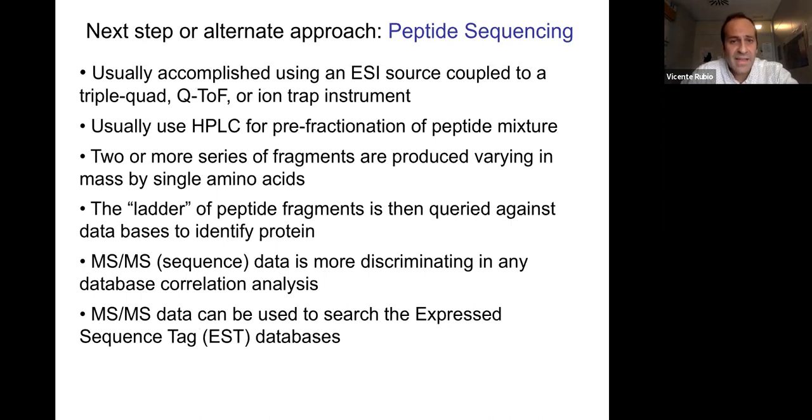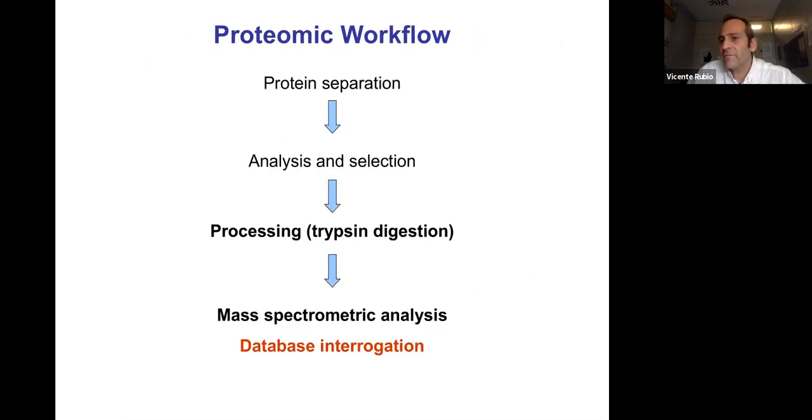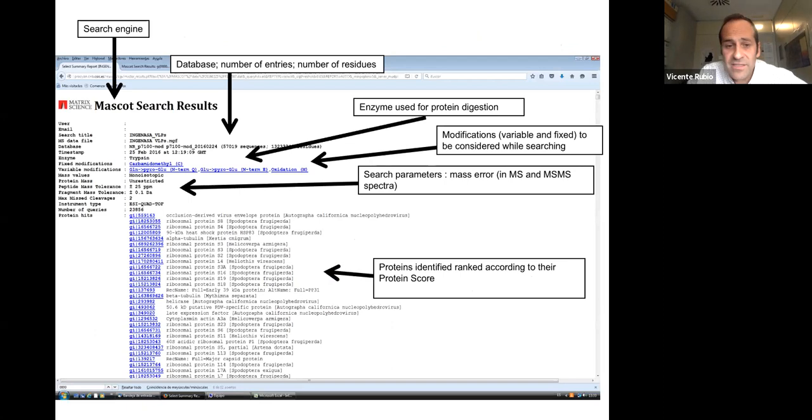So what you do after the collection of those peptides is to fragment them one by one and get another spectra for each peptide, depending on their fragments, and that allows a better, more reliable identification of each specific peptide. Okay, so once we have those spectra of the collection of peptides obtained from our samples, this is what you get, indeed. So this is what the user gets.